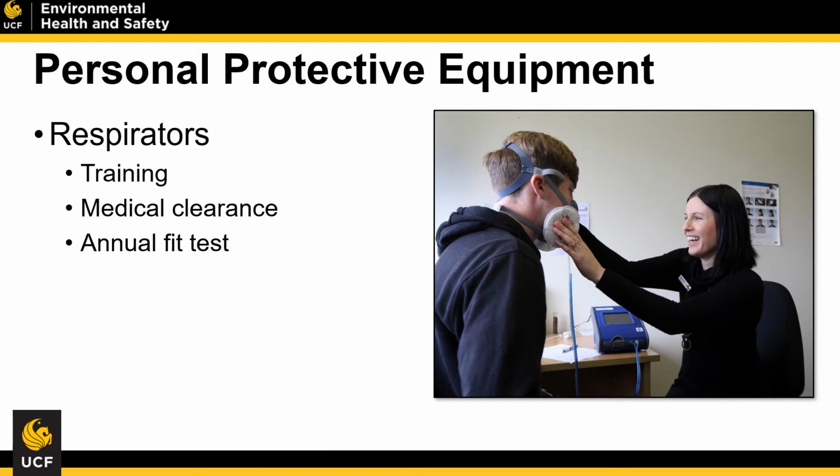Some labs have additional special hazards which require additional PPE. If you're working with fine particulate matter or if you're exposed to some type of airborne pathogen, we may ask you to wear a respirator. Anybody can wear a respirator. However, at UCF, to wear a respirator, you have to be medically cleared and fit tested.